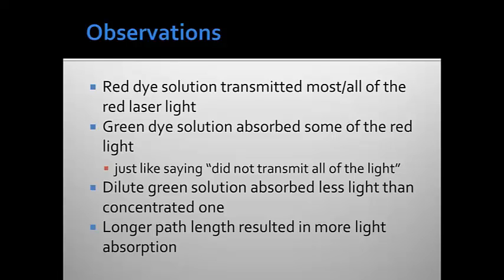Let's go ahead and summarize some of the observations that we've made. We saw that the red dye solution transmitted most if not all of the red laser light. However the green dye solution absorbed some of that light. When we had a dilute green solution that one absorbed less light than the concentrated one. And we also observed that the longer path length resulted in more light absorption.